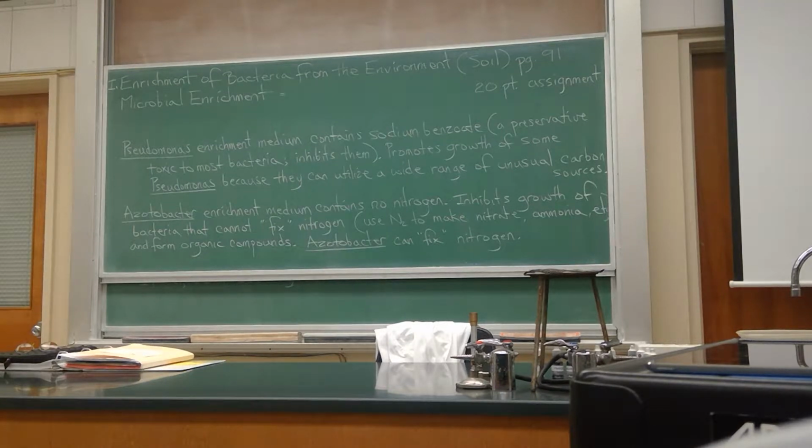Ordinarily, you guys will do this. You don't get to do it because we don't have the medium. So medium is being made right now. It will be available tomorrow, and I will transfer these for you guys. So I hope your tubes are nicely labeled so I can pull the label in the plates and transfer this out. You can say, well, why don't you let us do it next Tuesday? Because they shouldn't stay on the shaker too long. They've been on there probably a little longer than they should have been. I don't want to leave them on till Thursday.